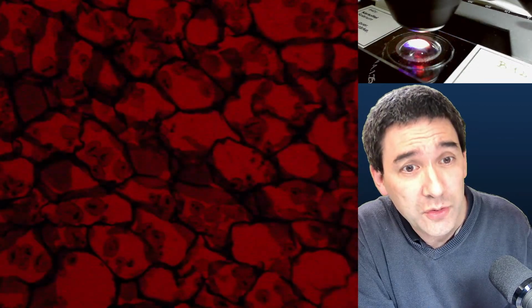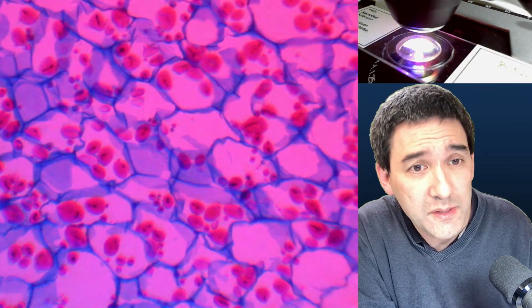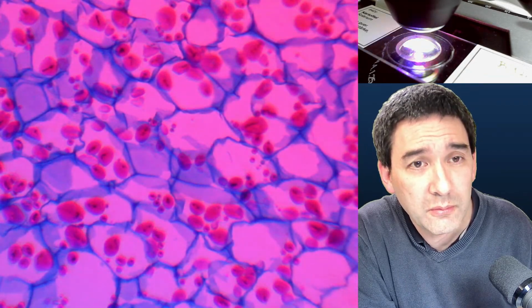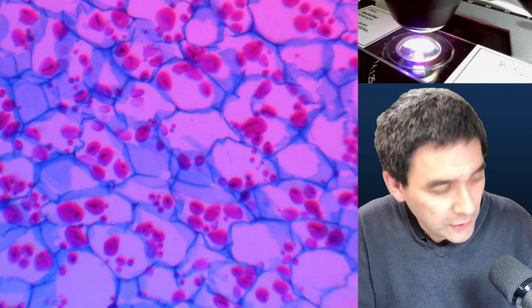And if I now use a filter, then this one over here starts to look like this. But the one that I used before was the yellow-blue one.